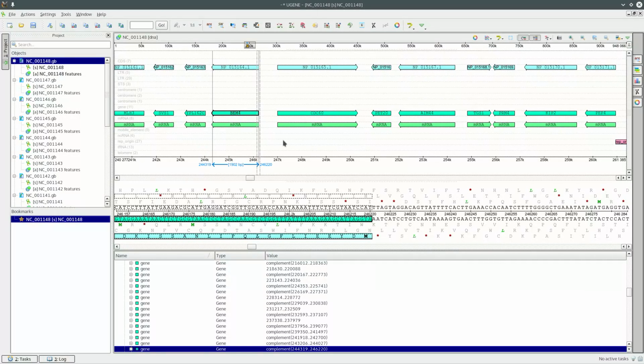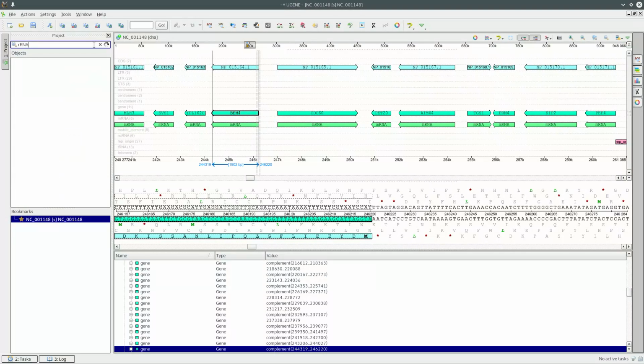So this is a brief overview in how to browse genomic data. To identify species, we're interested in looking at ribosomal genes. So we're going to have to filter through this metadata to find the ribosomal genes. Now, if I knew the gene name, I could type the gene name over here into the filter box. However, I don't remember the gene names, so I'm going to search for something else. Now, I know that the ribosomal genes all make ribosomal RNA, so that's what I'm going to filter for, rRNA.